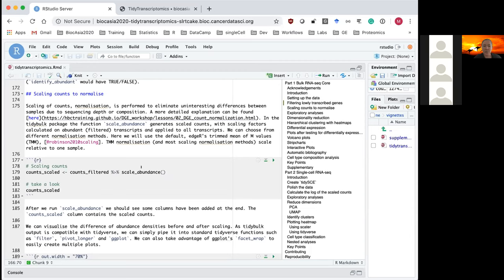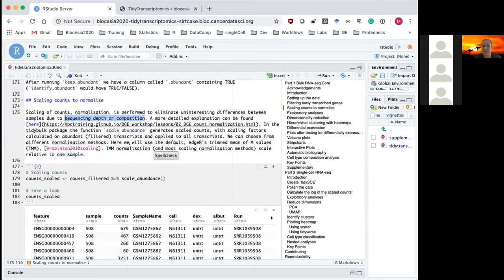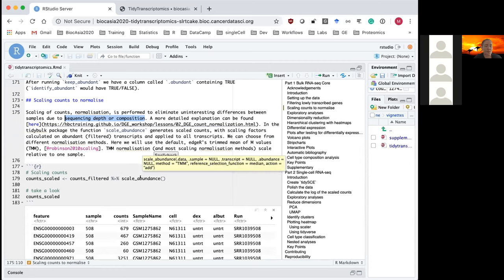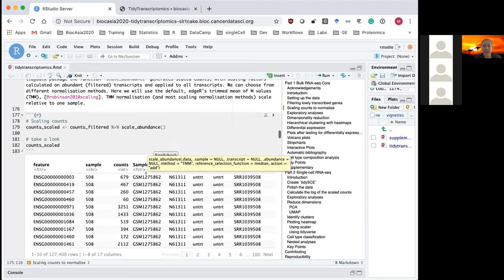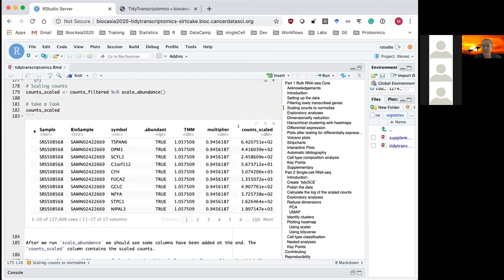Another step is normalizing samples — scaling our counts to remove differences that aren't biologically interesting, such as those relating to sequencing depth and composition. The default method tidybulk uses is TMM from the edgeR RNA sequencing package, though other methods are available. This adds columns to the table, with the most important being a new column of scaled counts.